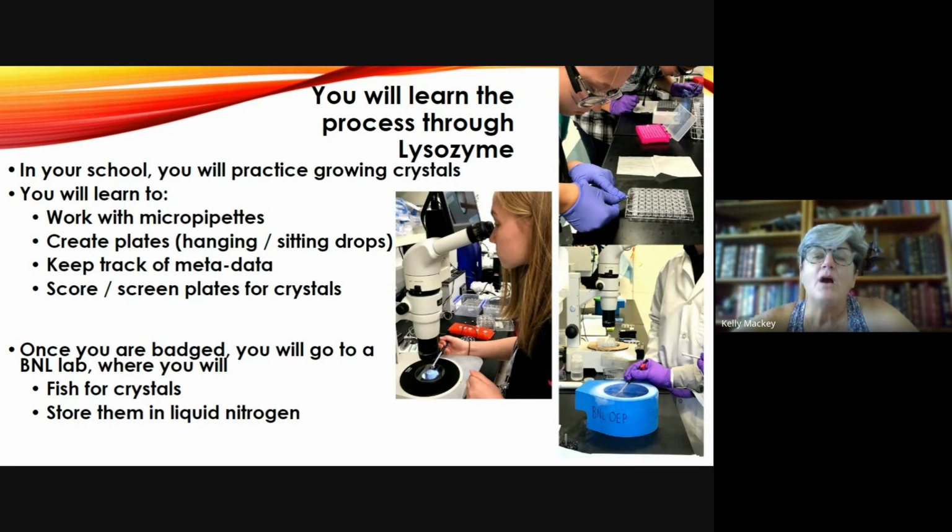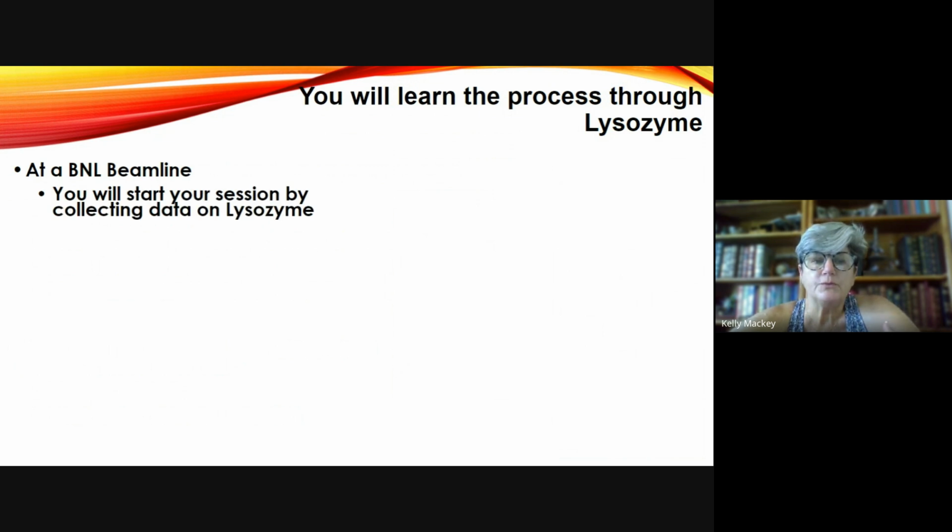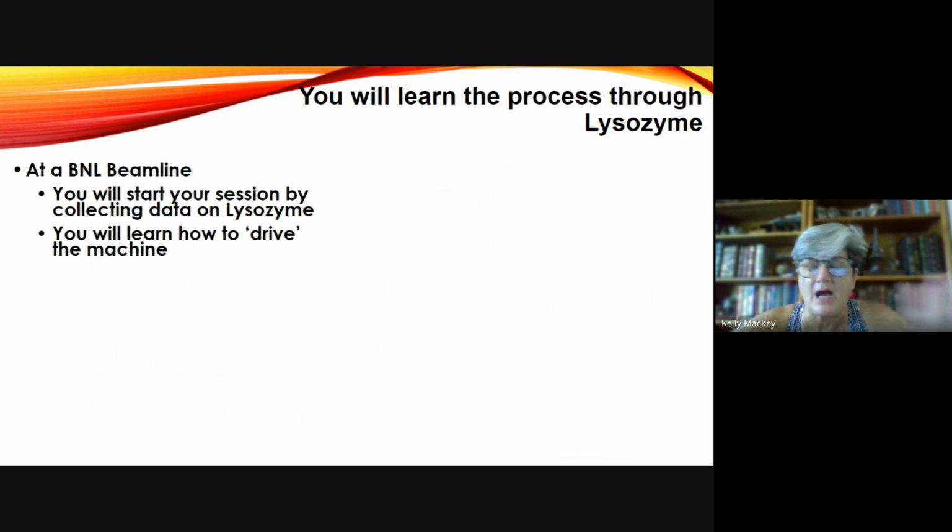to be taken to the lab. On a different date, when we have beam time, what we'll be doing is using lysozyme as the starting point for training on that day's beam line. So the first thing we'll ask that robot to load into the X-ray beam will be a lysozyme crystal. And this is how you will be taught while you're on site to quote unquote drive the machine. And that means to operate all of the controls that are at that particular beam line.